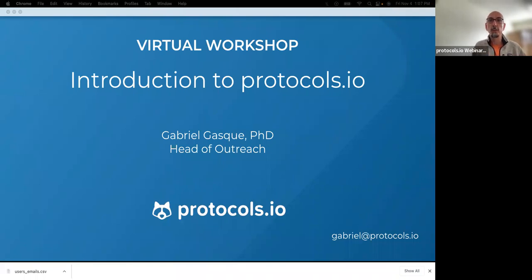So before we begin, let me introduce myself. My name is Gabriel Gasque, and I'm head of outreach at protocols.io. It is really a pleasure to be presenting this webinar to you. I am sharing my screen, and as I mentioned before, I will be recording this presentation and sharing the video and the slides with the participants.